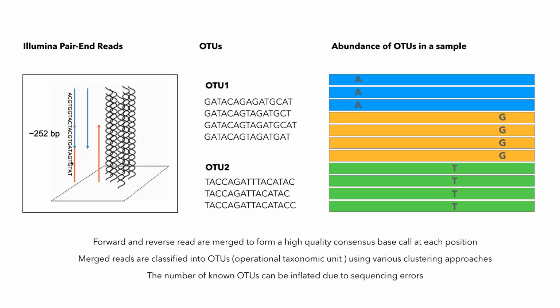And because of that high coverage, we need to merge them together by looking at just the ones that actually have pairs. So they have both the forward strand and the reverse strand reads. So we need to eliminate those that do not have those pairs and then develop a consensus. So where do the sequences agree, in order to organize them into these operational taxonomic units.